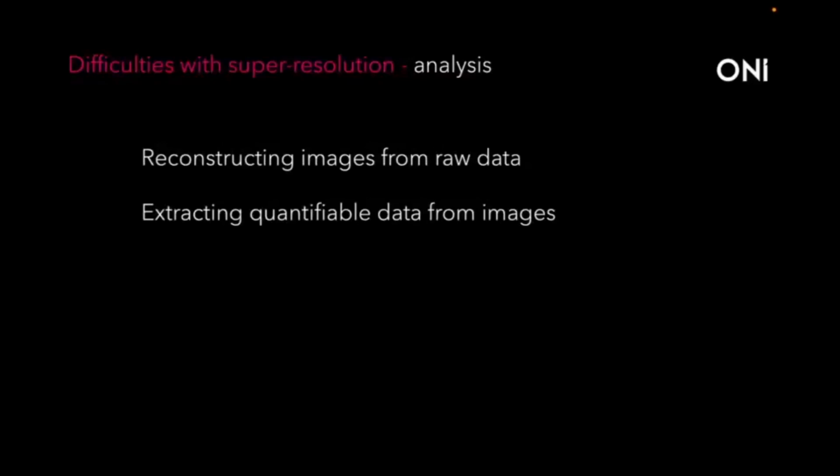Similarly, with the analysis, you have to be able to reconstruct the images from the raw data, and you have to be able to extract the quantifiable data that you want from the image. Again, all of this requires a lot of expertise. So these are the general barriers.